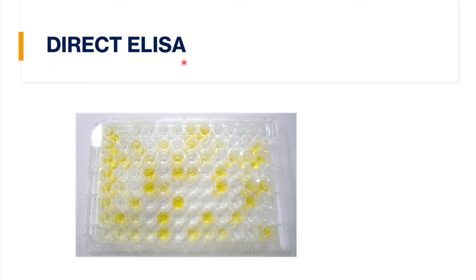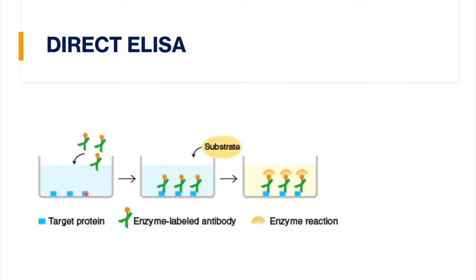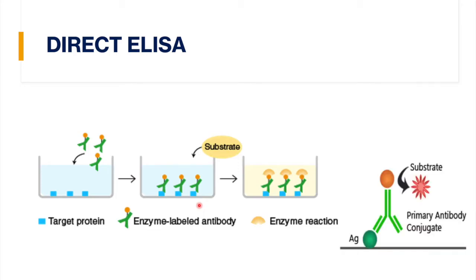Your biological samples will be loaded into a multi-well plate, as shown here. In each well, the molecules in your sample are coated or stuck onto the surface of the well. This includes your target antigen, if it is present. In this diagram, the target antigen is a protein. You then incubate the well with an enzyme-labeled antibody that is specific to the target antigen. This is where the antibody-antigen reaction is important. Recall that lab-made antibodies are highly specific. It will bind only to the antigens it was designed for, forming an antibody-antigen complex.